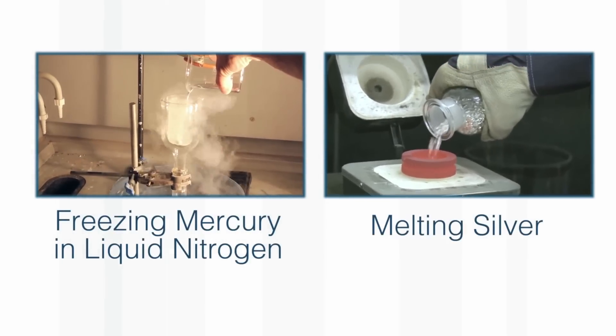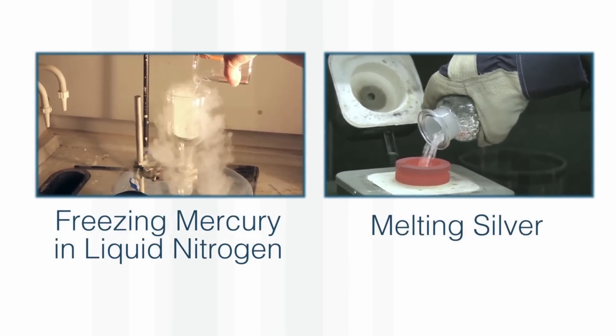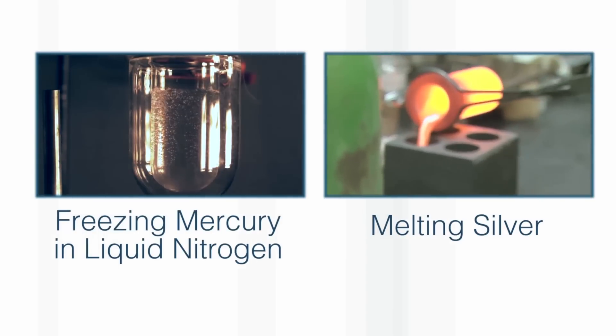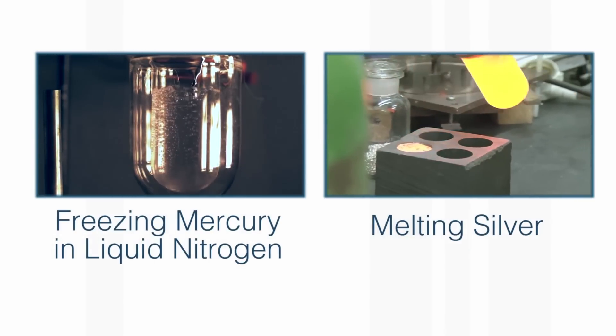What's interesting is that as it goes into the liquid nitrogen, the nitrogen boils and so the mercury falls almost encased in a sort of bubble of nitrogen gas.